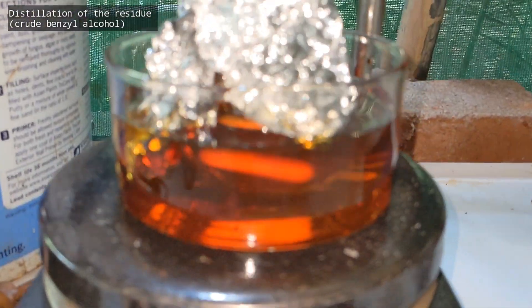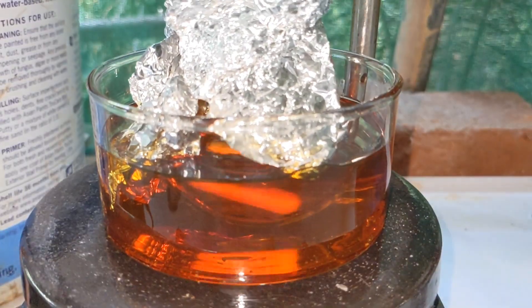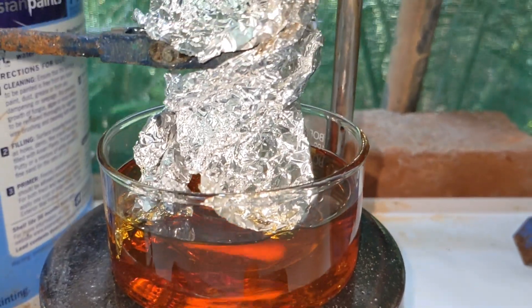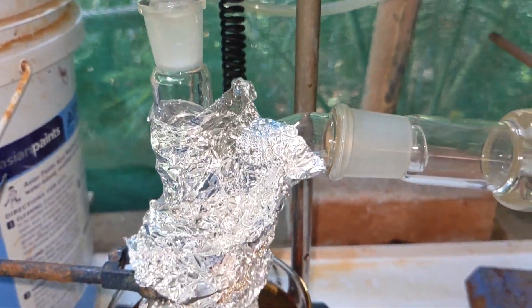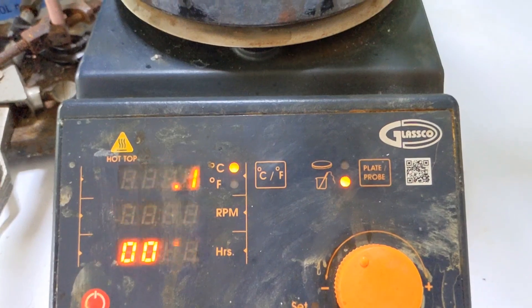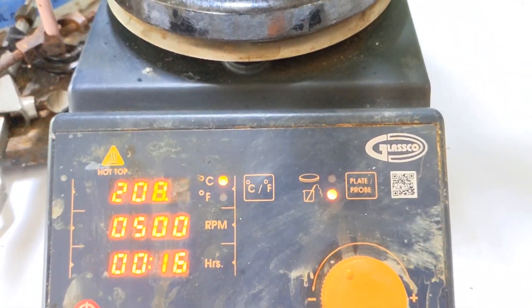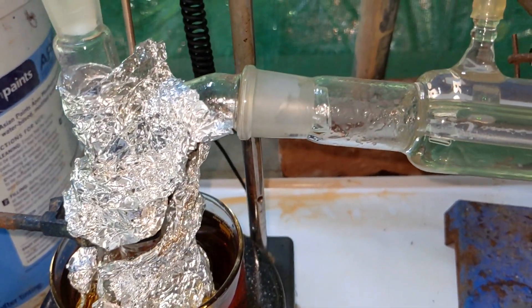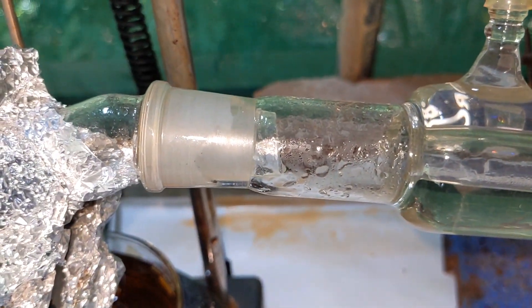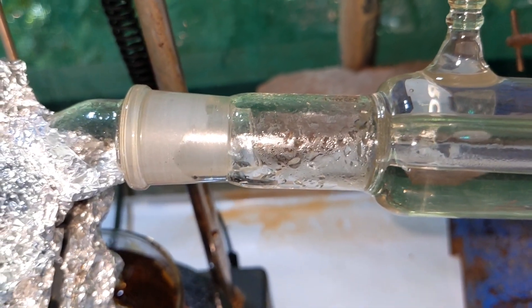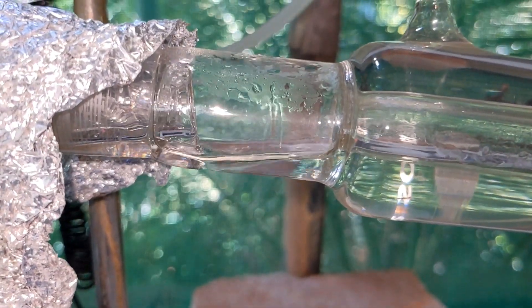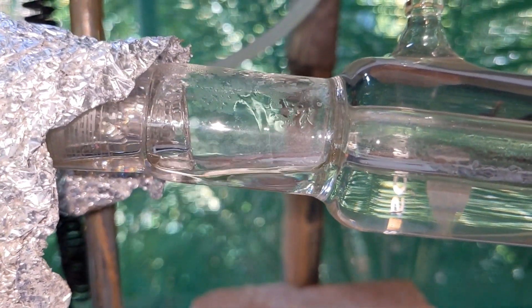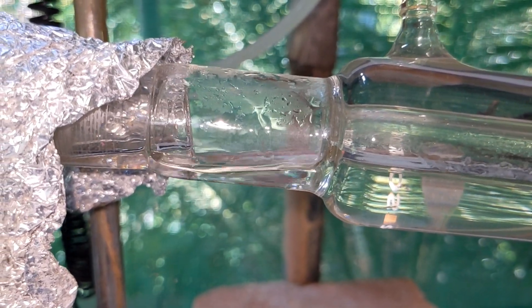Once all the ether was distilled over, the water bath was replaced by an oil bath and the residue that contains benzyl alcohol was distilled. Aluminum foil was used for efficient heat. At around 208 degrees Celsius distillation has started and the product is getting distilled over in a steady sequence. It is actually a colorless clear solution as you can see in the initial part of the condenser.